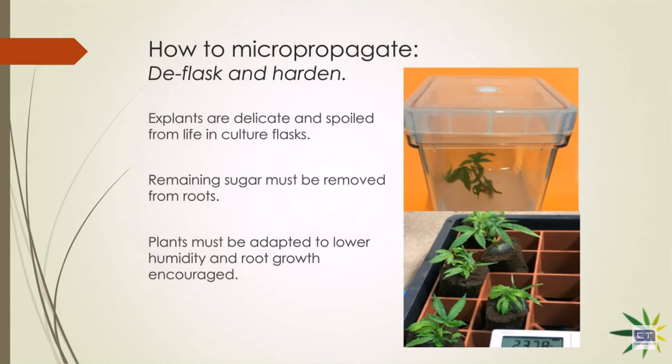It has a little funky clear little food source, I guess. Is that what that is? That's honestly just, there's a balance you have to strike. When you yank these things out of the agar, you can damage their roots. But they work so hard to grow. If you can get the timing right, they don't have a whole lot of roots, but they're just ready to blow up.